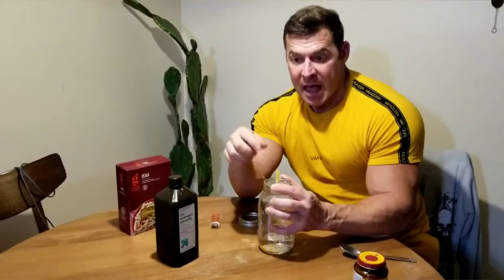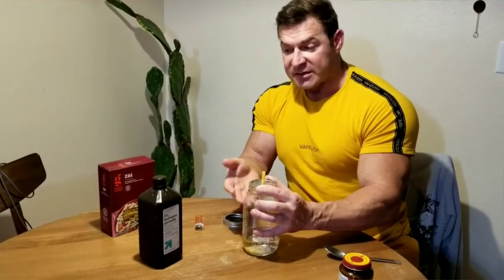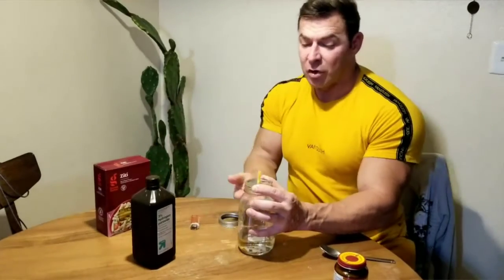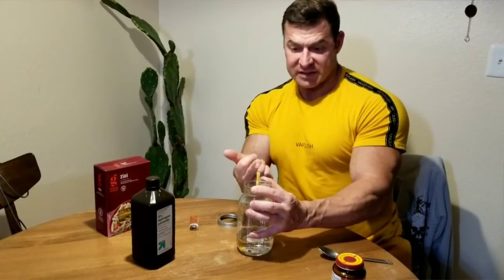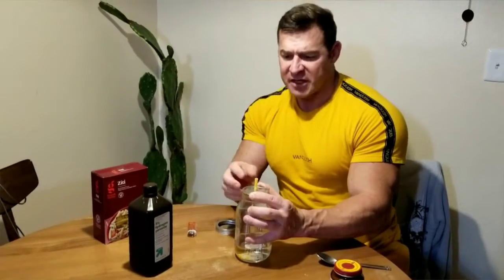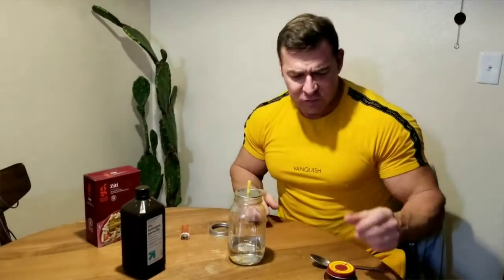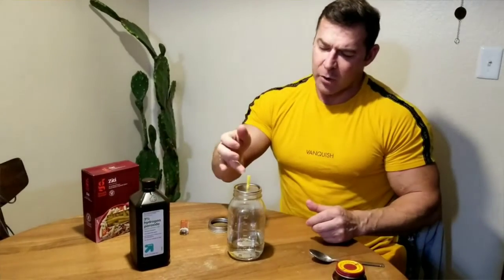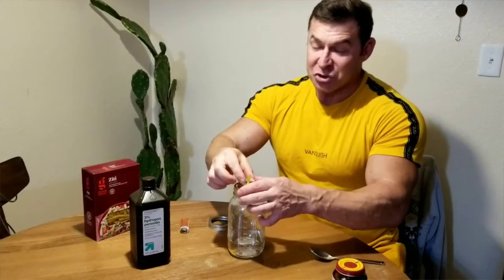We're going to light it up, and it will burn aggressively, because oxygen under pressure that is separated from the hydrogen because of the exothermic reaction is going to rush up and through the ziti. That's why the ziti pasta will burn fast and aggressively, because we need oxygen. It's almost like a hybrid. We have all these fuel sources: the yeast and the peroxide, this mixture together is like an oxidizer, and we have the solid, the carbohydrate, the ziti. Okay, so let's do this.